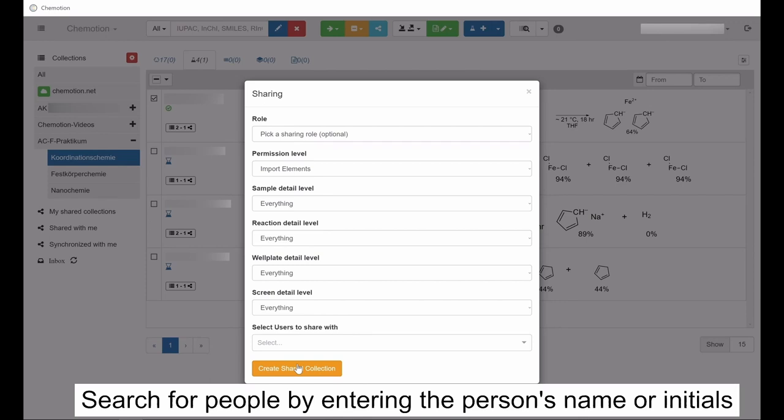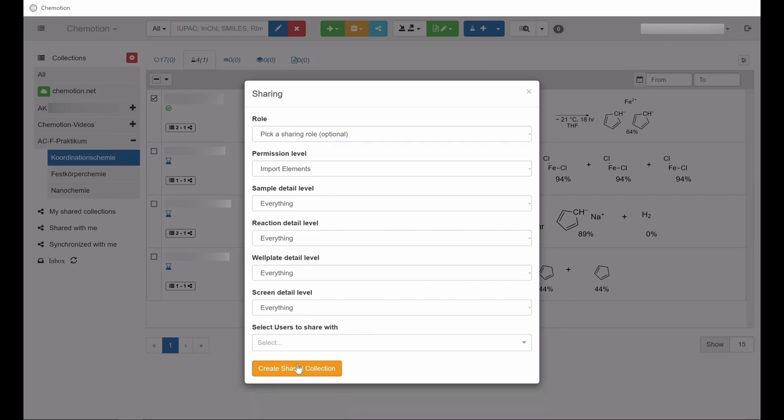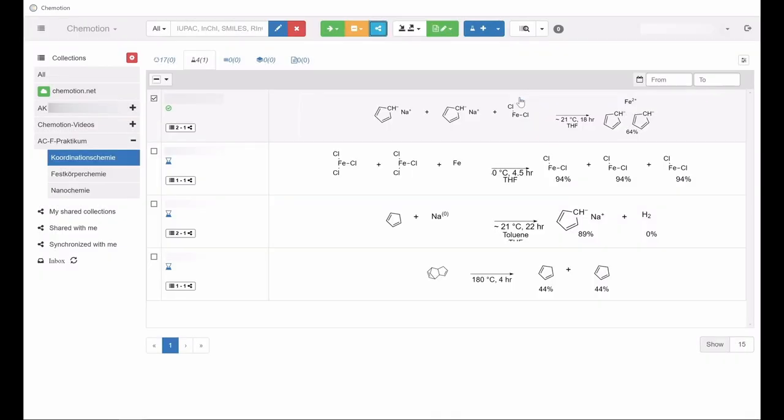As a result of the sharing process, a separate shared collection will be generated, which can be accessed on the column on the left.